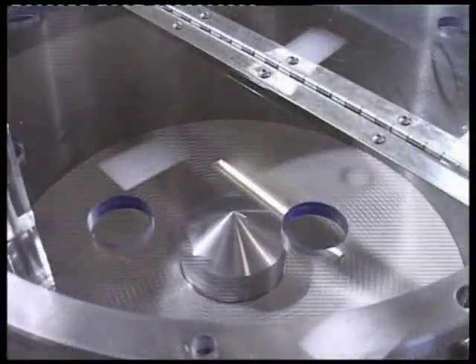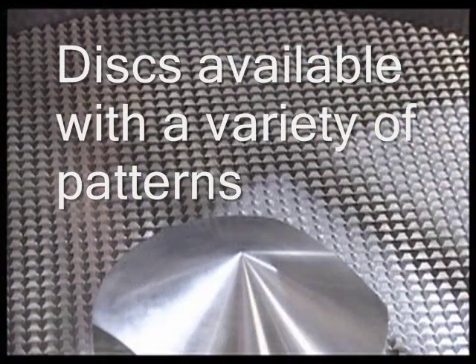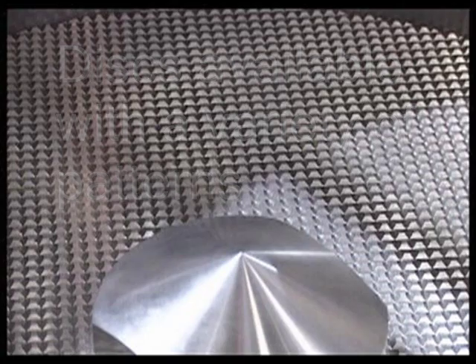Depending on your production needs there are several disc options available, including different crosshatch patterns or a radial groove disc for gentler processing.